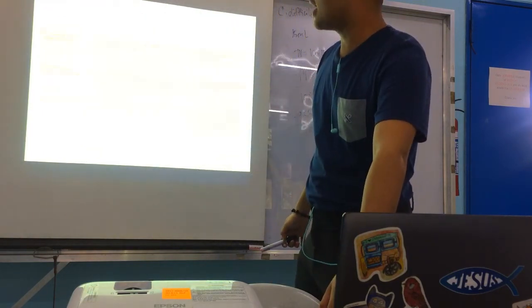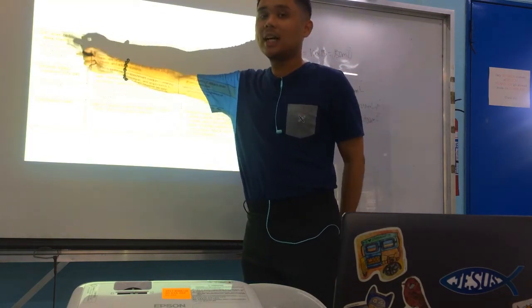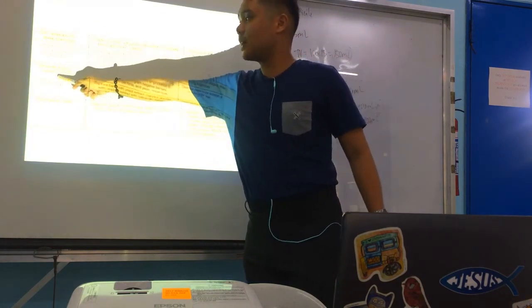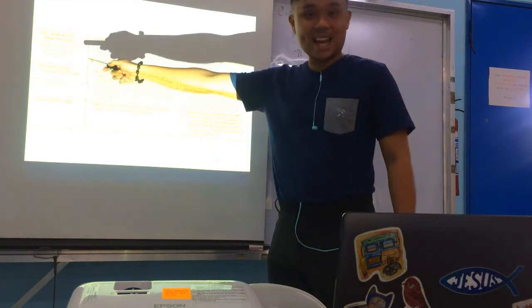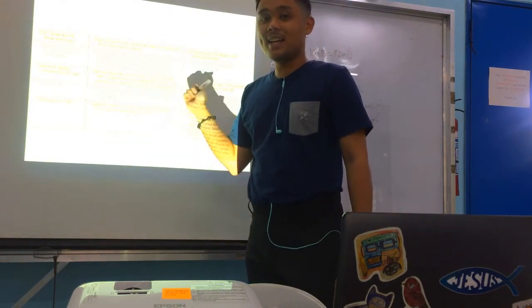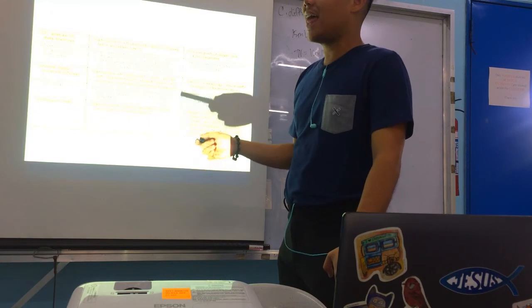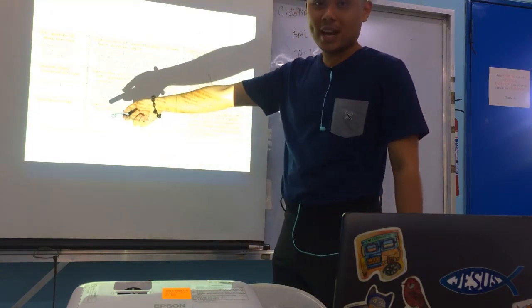Next, please take note: cefoperazone, vancomycin, and amphotericin. These are types of antibiotics. Same with cefsulodin, irgasan, and novobiocin. So CCA is for Campylobacter. CIN, bullseye colonies on CIN, is for Yersinia enterocolitica and Aeromonas. Alright. Chocolate agar, for fastidious organisms. Chromogenic.